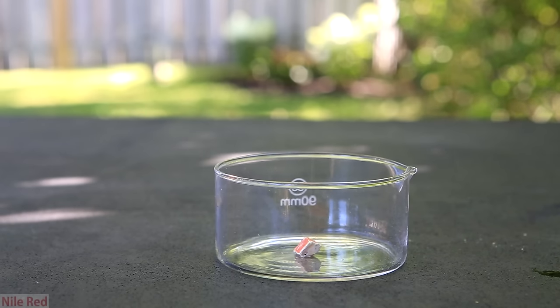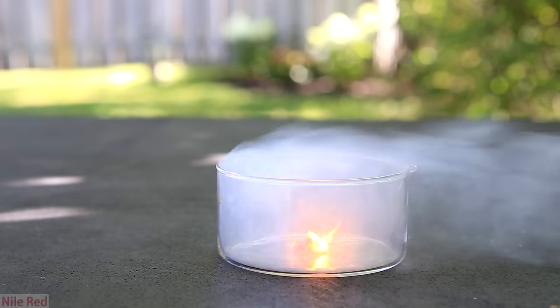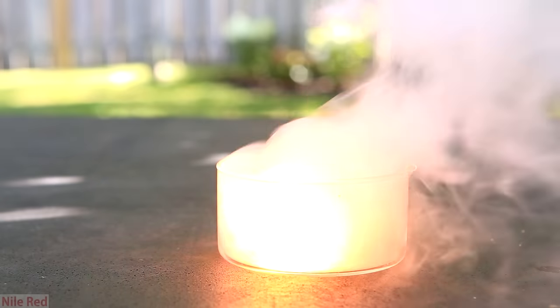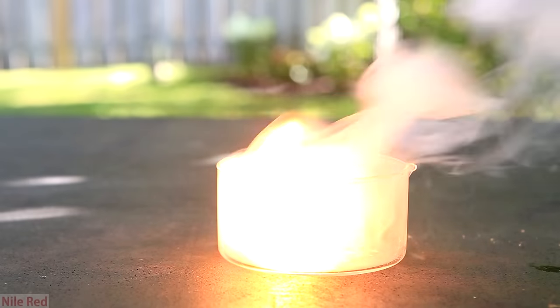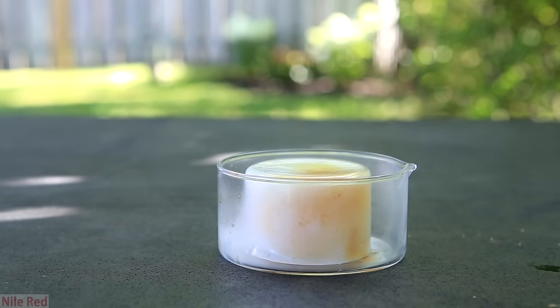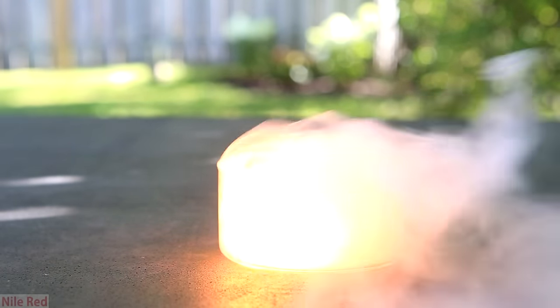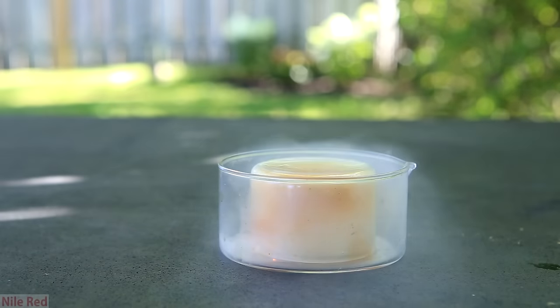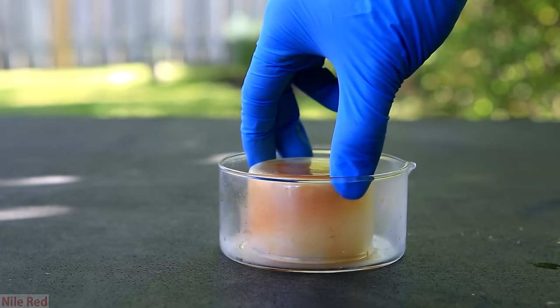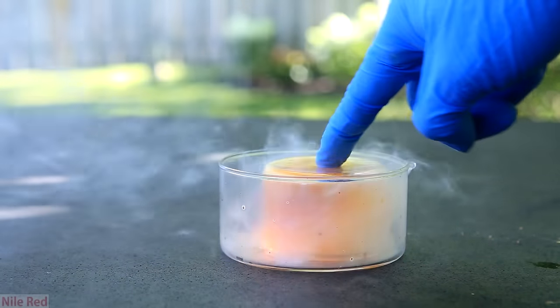Now for the fun part of lighting it on fire. Using a barbecue lighter, I light it on fire and you can see that it quickly gets going. To put it out, I simply place another crystallizing dish on top to cut out its oxygen supply. Right when the crystallizing dish is removed, immediately it starts burning again. This is because it can spontaneously ignite at temperatures as low as 30 degrees Celsius.